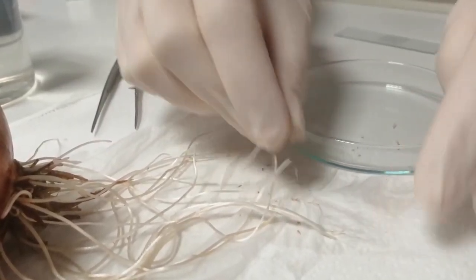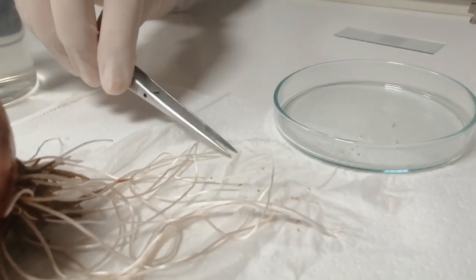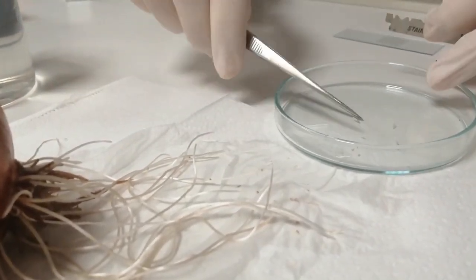We cut the tips of the onion roots with a blade and place them into the watch glass.